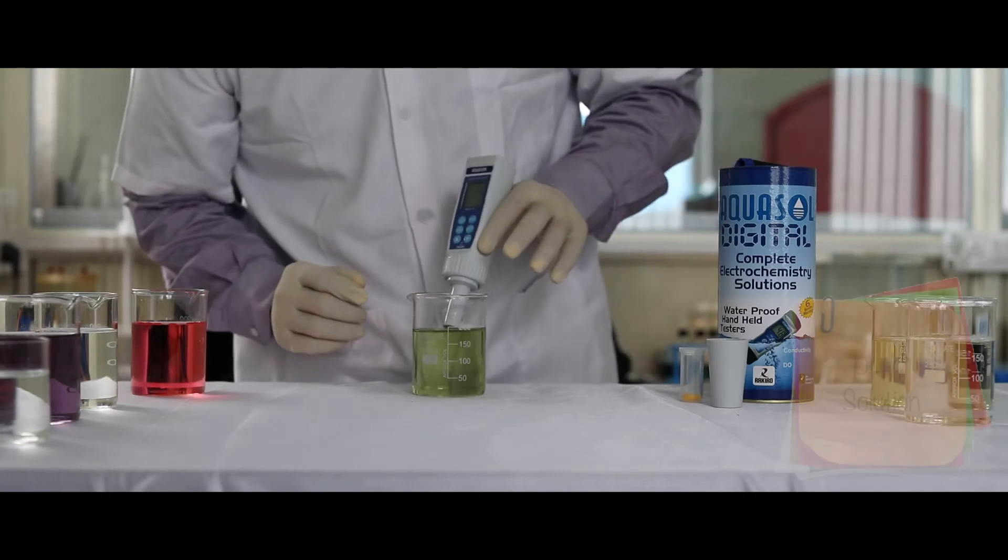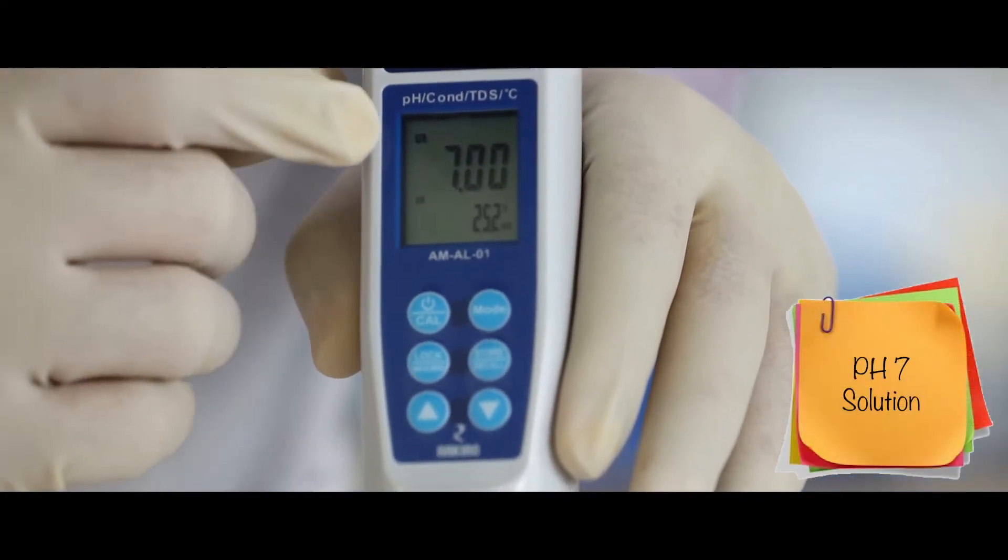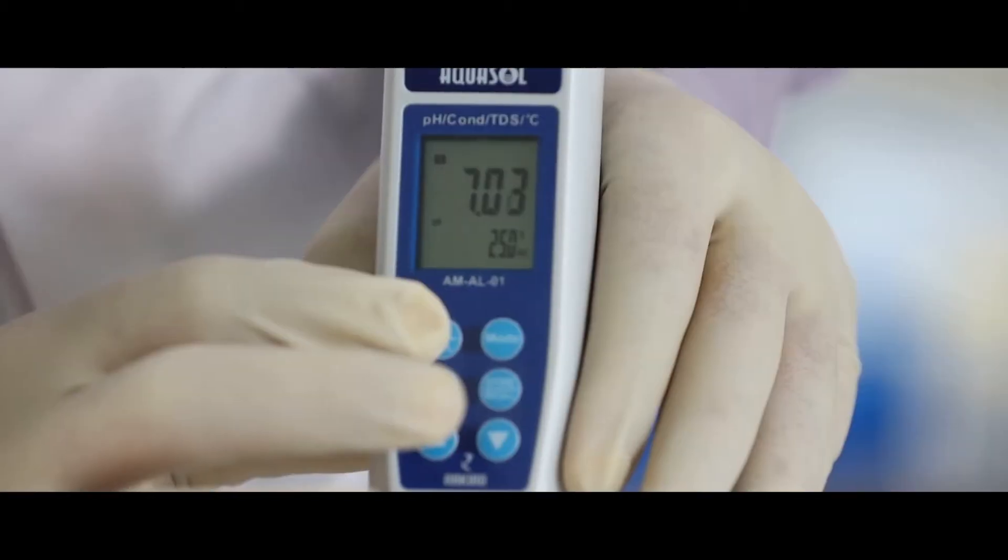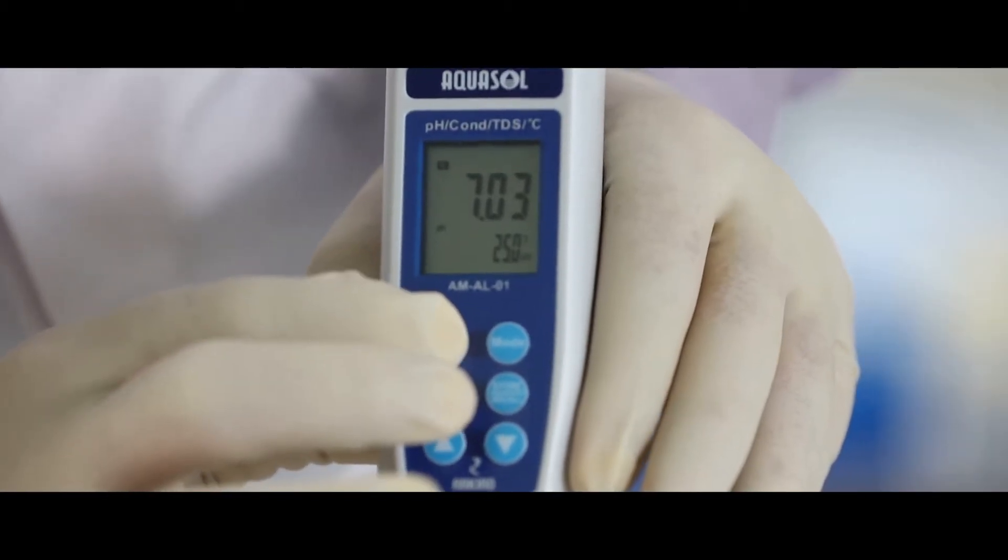Calibration of pH. Dip the electrode in the standard pH 7 solution. Stir for a stable reading, then press CAL key to calibrate.